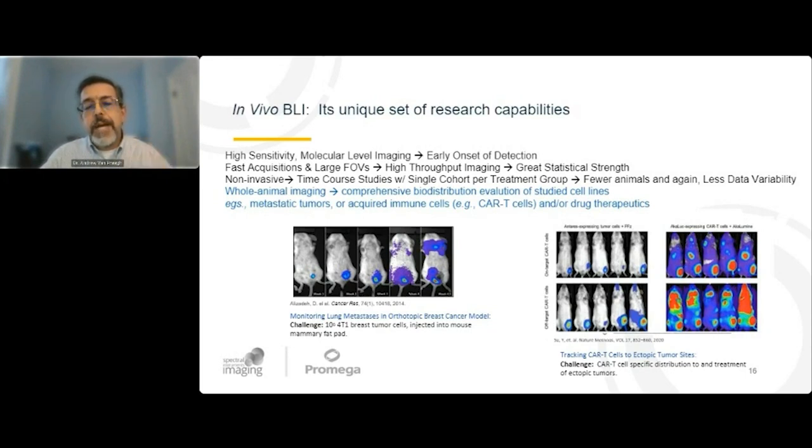here. Now, CAR T cells that specifically recognize this tumor were then used to basically treat the existing tumor mass by binding to them and having their effector functions activated. What you can see in this instance is in the top right image, the CAR T cells that specifically recognize the tumor have a very restricted distribution, whereas CAR T cells that don't recognize this specific tumor, a different lineage of CAR T cell, the distribution is much more diverse. And so this is proof of concept behind the efficacy of a specialized CAR T cell population against a specific tumor.